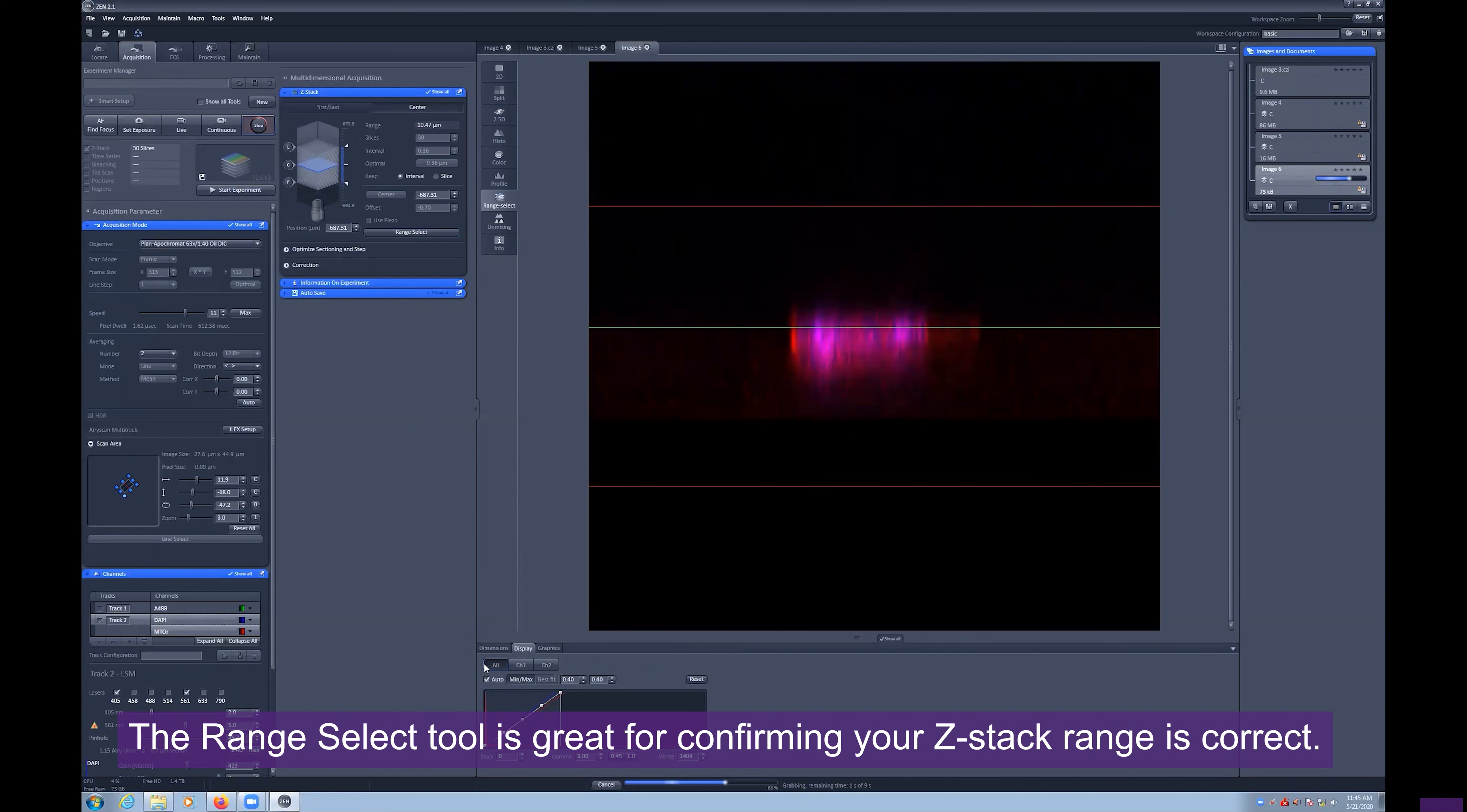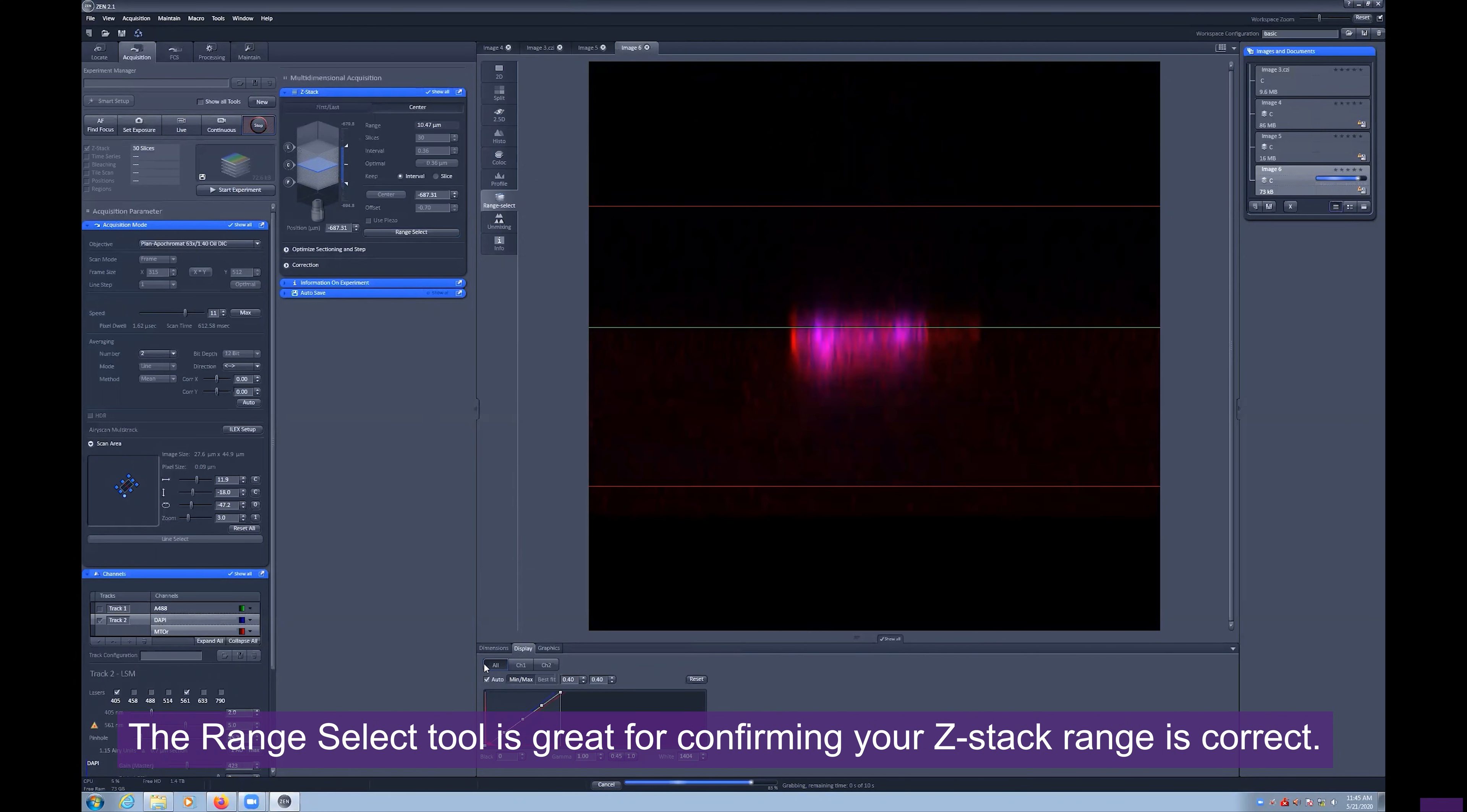The red horizontal lines denote the Z-Stack range, with the green line showing the center slice.